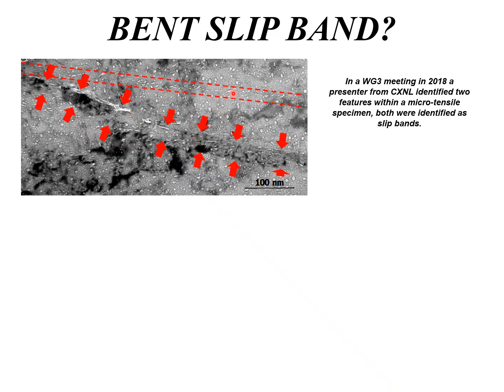So this is where it's important not to jump to conclusions. Oh, I see cracking, and therefore this cracking is related to that. There are other things that can explain the cracking, and it's not necessarily this channel fracture or even a twin effect.